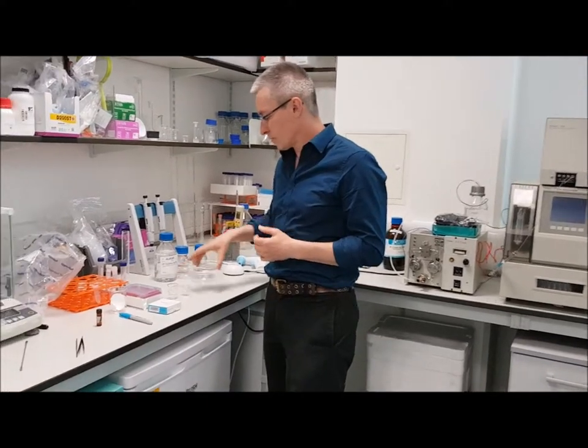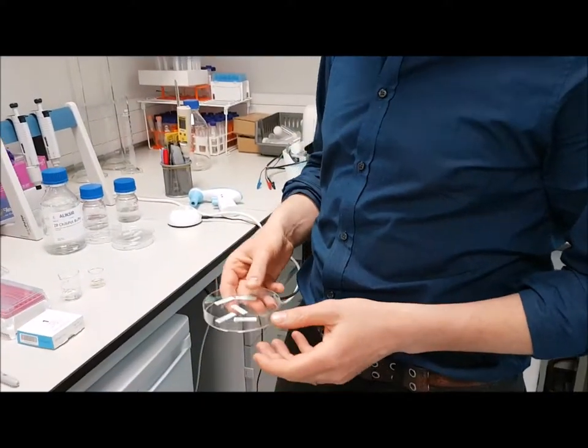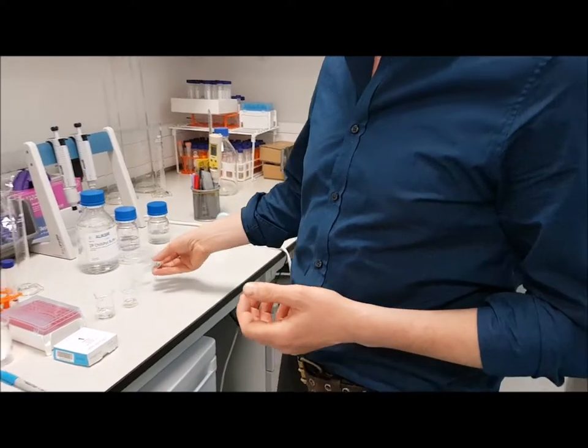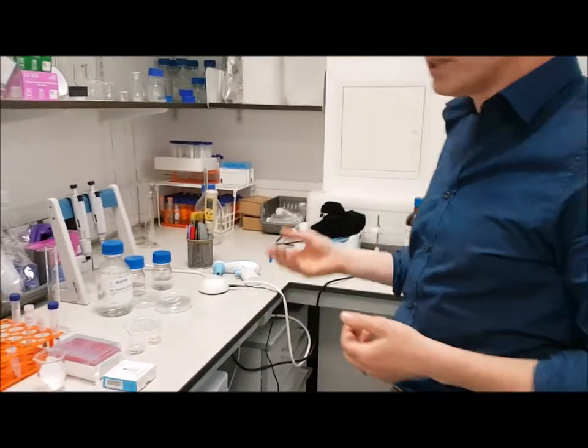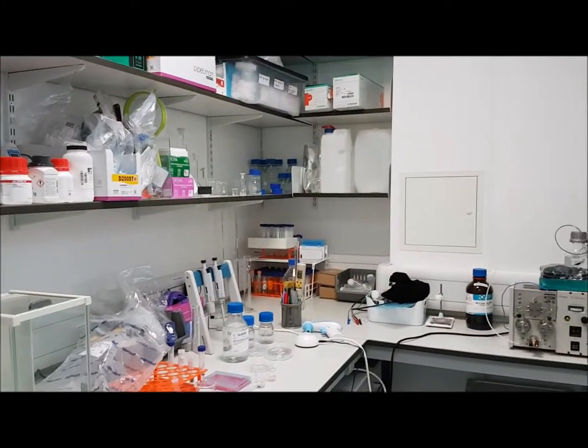We are a biosensor development company. So obviously, you can see the guys are busy functionalizing these sensors, and the analytical glassware that you would expect so that we can accurately make up solutions.